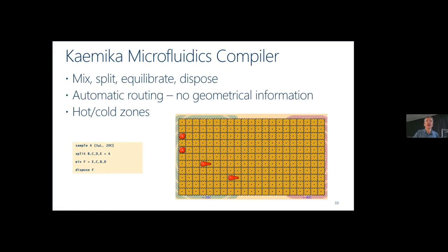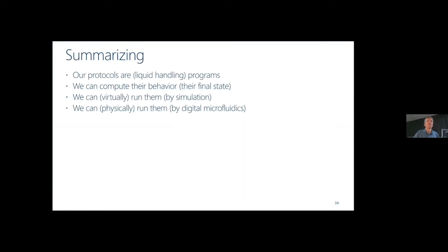Now, Kaemika, the app, gives you a way to simulate these kinds of protocols. And it's simulating them as a digital microfluidics virtual device. So there are droplets, and I will show an animation in a little bit, where you can run the protocols like split and mix and dispose, and the droplets will move around and will compute the result of the simulation. So summarizing this part again, our protocols are programs, they're liquid handling programs. We can compute their behavior, their final state, by the semantics I showed you. We can run them virtually by simulators, and we can also run them physically by digital microfluidics.